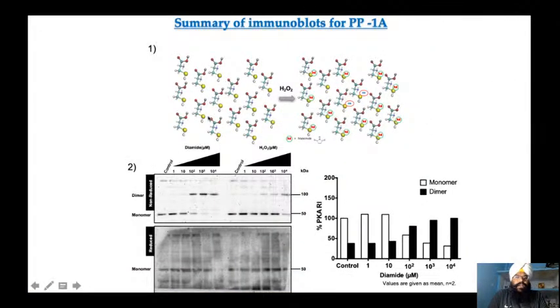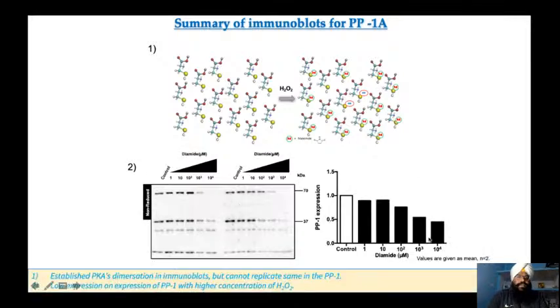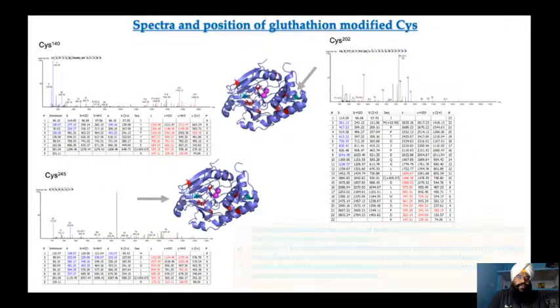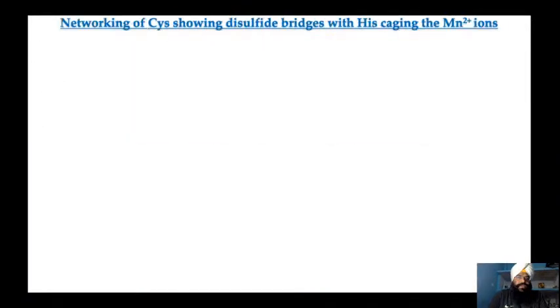This is the Western blot also done in the presence of diamide and H2O2 with control, 1, 10, 100, and 1000. So it was reduced and it was non-reduced. This was monomer and the upper one was dimer, at 50 and 100 kilodaltons. So we can see a very nice dimer formation in this. These are the various plots that we ran with the help of 2D SDS-PAGE actually.